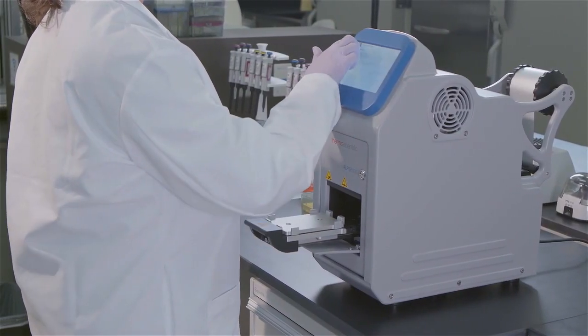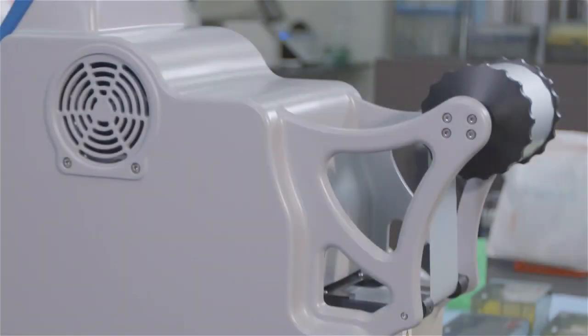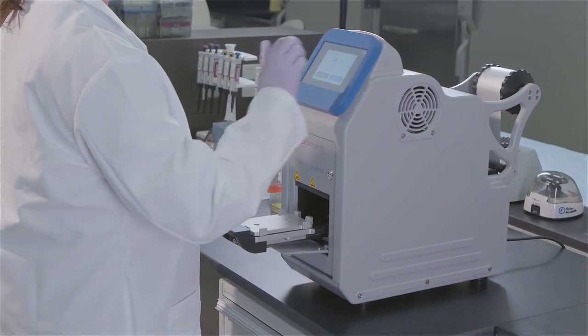To unload foil at any time, tap unload and the foil will feed from the back of the unit. The main screen displays preset program settings, which can easily be adjusted.